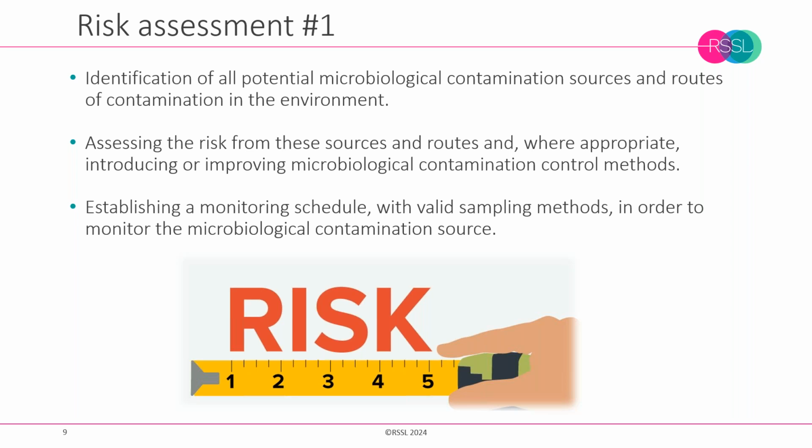This methodology allows us to look for potential contamination sources as we trace the routes that product takes, the route that people take, the path that equipment takes, and also the way that waste would leave an area. That can help us with locations and to a degree with the most appropriate methods, and also in helping with the scheduling.